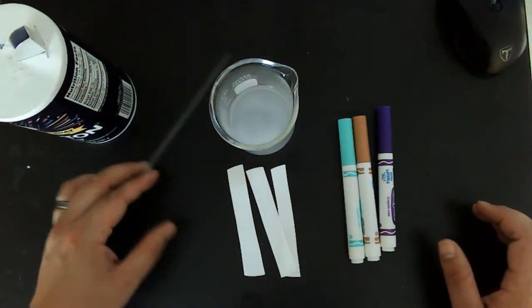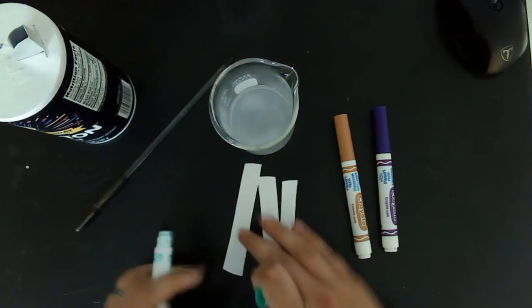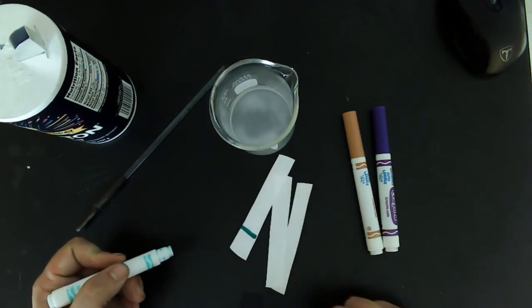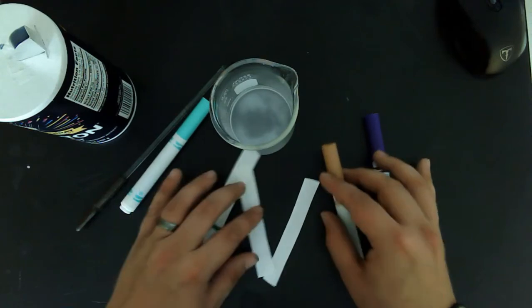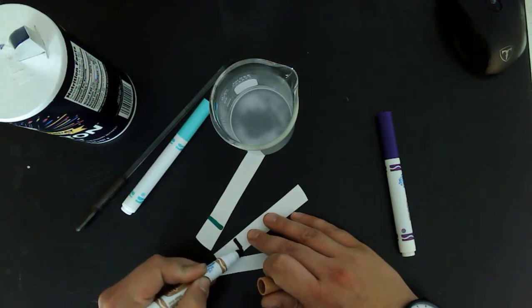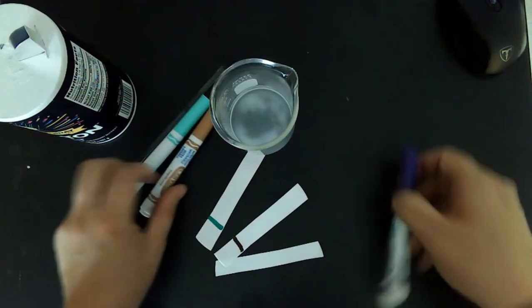Okay. Next, we're going to take our markers and make a nice heavy mark, not at the bottom, but some distance away from the bottom, because we want these markers to soak up the saltwater solution, but not soak in. And last but surely not least, we have purple.